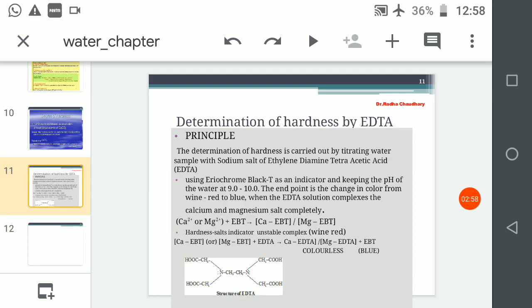The equilibrium is markedly affected by the pH of the solution. The complexes of EDTA with divalent metal ions are stable in slightly basic solution. The structure of the anion H2Y2- and its complex with a divalent metal ion you can see in the diagram. What's the basic principle of this EDTA method? The quick, complete and 1:1 interaction of metal ion with the EDTA, leading to the formation of a stable complex, is the basis of the complexometric titration.